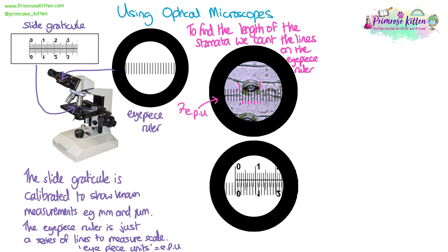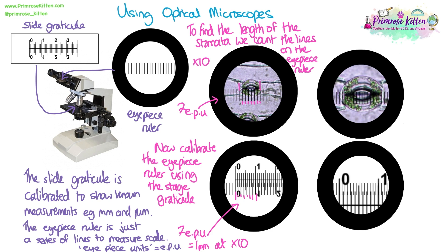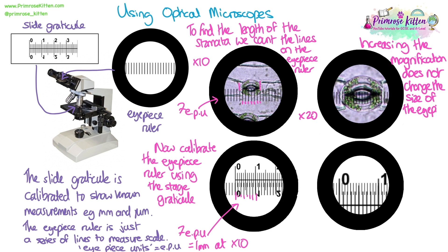I then remove the leaf tissue slide, replace it with my graticule slide, and line up the eyepiece ruler over the graticule ruler to see how many eyepiece units equals a known length. Here, my seven eyepiece units is the equivalent of one millimetre. It's important to remember that the actual size of the stomata doesn't change — you can view it at different magnifications. If we switch to a times 20 objective instead of times 10, I've effectively doubled the apparent size, so now the stomata measures 14 eyepiece units.